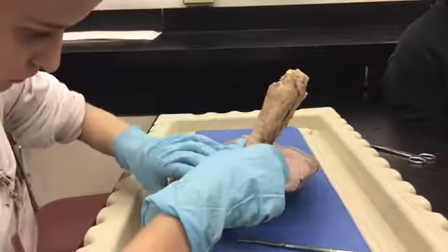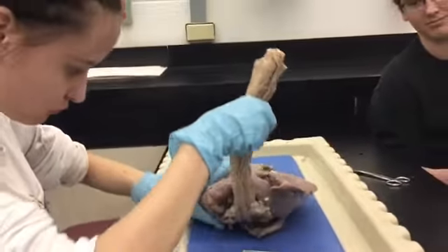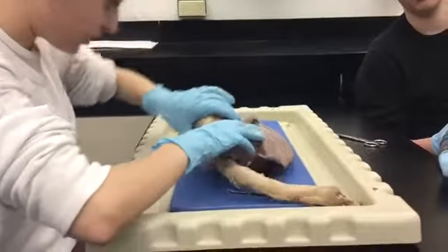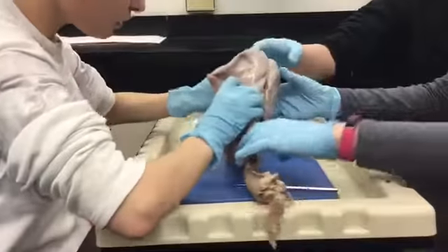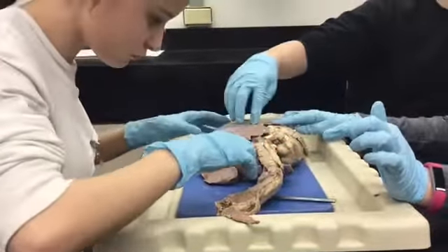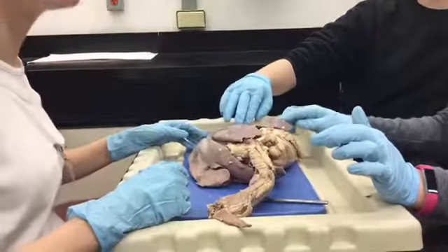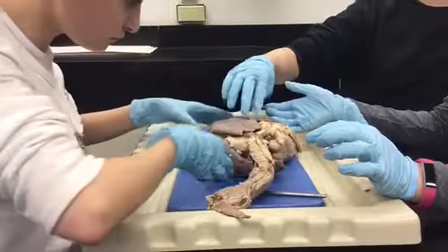All right. Now look at your lungs. Can you find the three lobes on the right lung and the two lobes on the left lung? Because that's how you're going to ID it tomorrow. This is the right. Left. No, because there's three. I said the right has three. So this is the right.